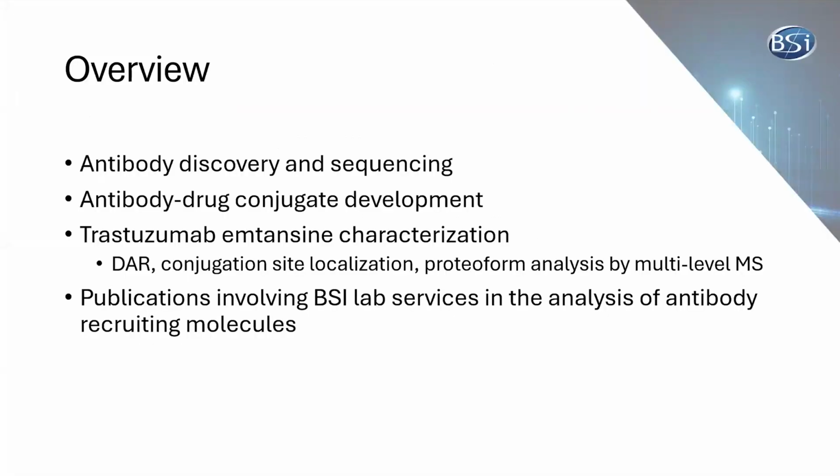Okay, so just a quick overview of what I'll be discussing in this webinar. I'll first briefly touch upon antibody discovery and how we perform antibody sequencing. Then I'll go into some considerations that need to be made for antibody-drug conjugate development. And then I'll provide an example of an ADC that we've analyzed in our lab, which is trastuzumab emtansine.